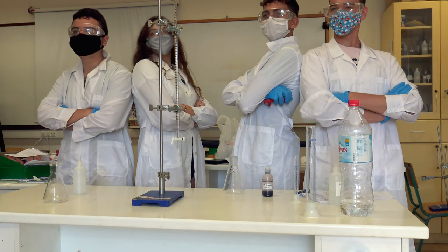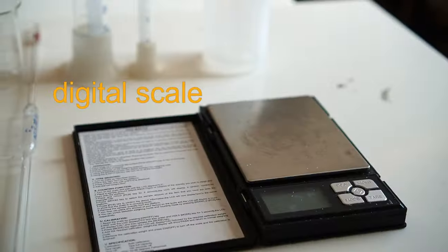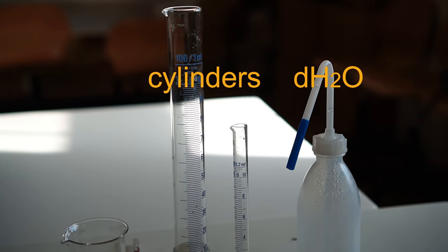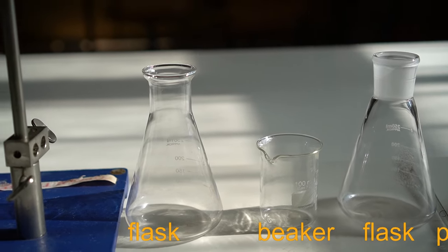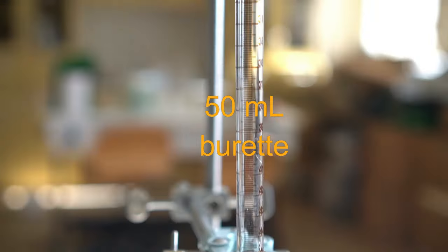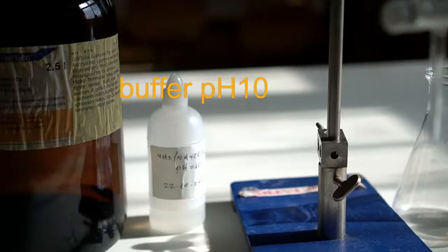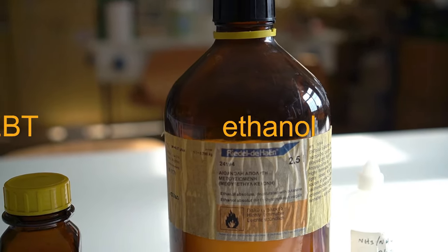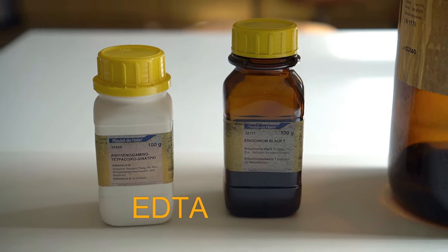To perform this method we need four specially trained high school students and the following: a digital scale, deionized water, graduated cylinders, a volumetric pipette, a beaker, conical flasks, a 50 ml burette, a buffer of pH 10, ethanol, eriochrome black T (EBT), and freshly prepared EDTA solutions.